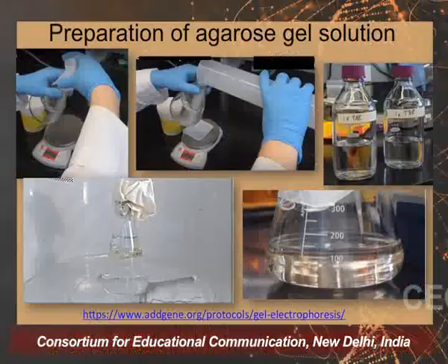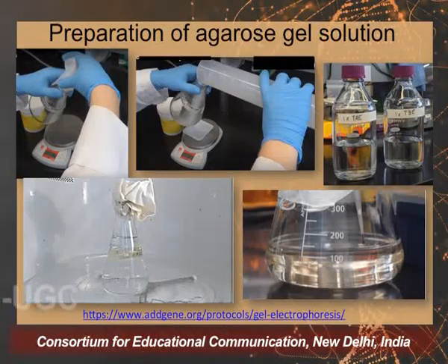So working is generally 1x or 0.5x TBE and stock solutions of 10x TBE can be made and stored, and at the time of need the solutions or buffers can be diluted. So the next thing is when you need to dissolve the agarose completely, which is done by microwaving it for 2-3 minutes, until it comes to boil and it becomes a transparent solution.